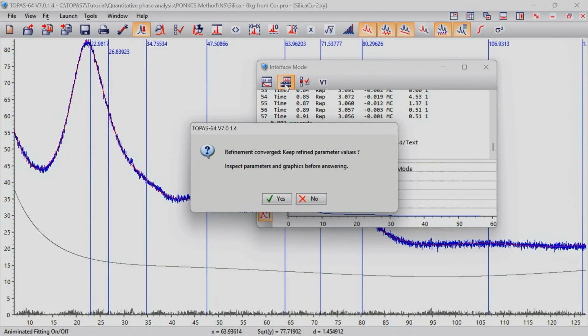I think maybe the concept to this point looks a little bit overwhelming. But if you think about what the Rietveld method is doing, the Rietveld method is at no point trying to decompose or deconvolute peak overlaps. The Rietveld method does not know and does not care about peak overlaps. What it does is fit to the intensity envelope, and the individual peak intensities are attributed by the constrained structure.